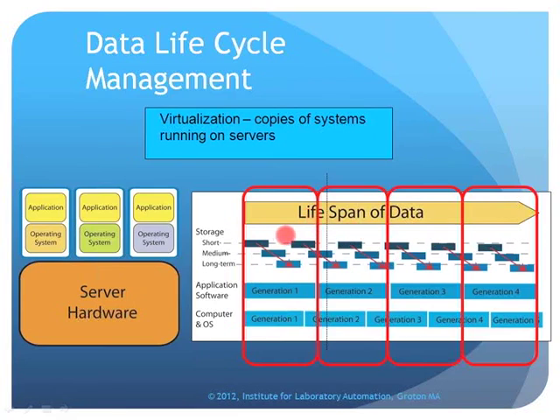That allows you to take a look at any of the data and use it within the context it was generated in. And that's important because the algorithm that was used down here for doing some analysis may not be the same as the algorithm that's used here. It may have been improved or changed. And you really want to evaluate the data with the same set of software it was collected with, not against a new set of algorithms, because that may create a change in the data that you have to account for.